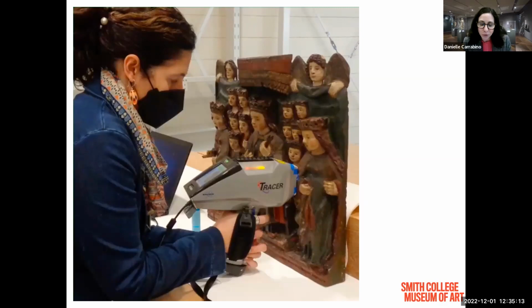Another analytical tool that we use to learn more about these sculptures is XRF spectrometry. Our colleagues from the Isabella Stewart Gardner Museum, Jess Kloros, who's pictured here, and Greta Yanis, joined us at the museum last fall to carry out this examination. You can see Jess is holding an XRF spectrometer. Valentine, could you please explain what XRF spectrometry is, first of all, and why it is an important tool for conservators, but also talk a little bit about the results that we got from this analysis and what they told us about the works.